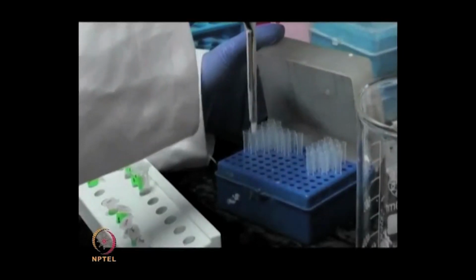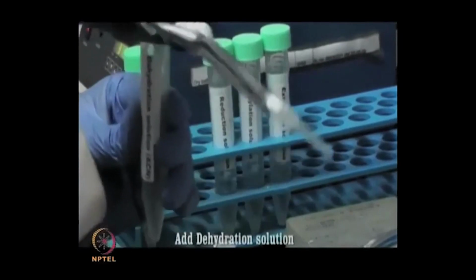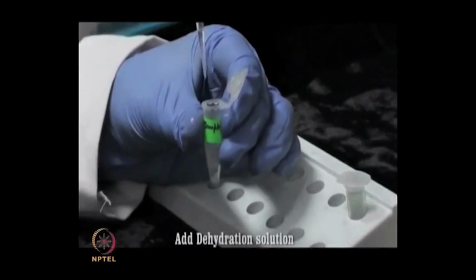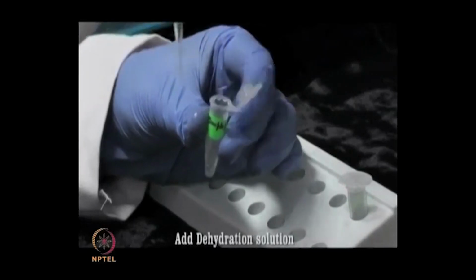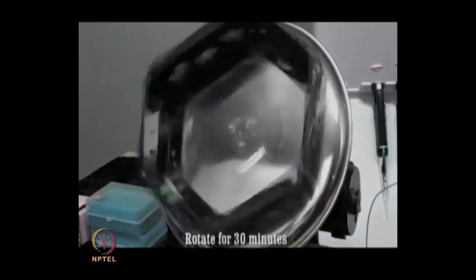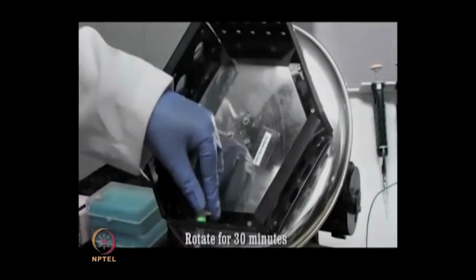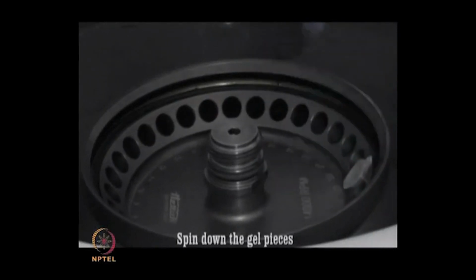Now, once the stain is removed, then you can add dehydration solution. So, add 50 to 100 microliters of dehydration solution and rotate that at room temperature. You need to ensure that you change the solutions after every 10 minutes, so that gel pieces become white and stick together.